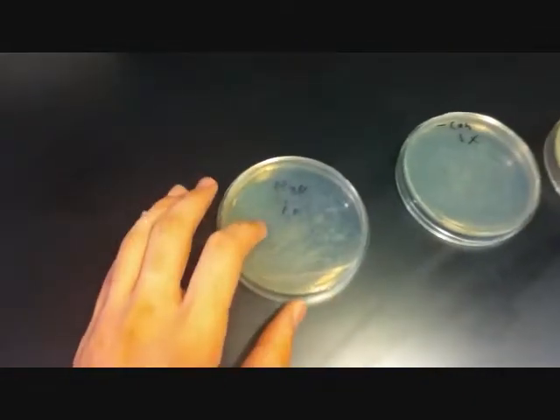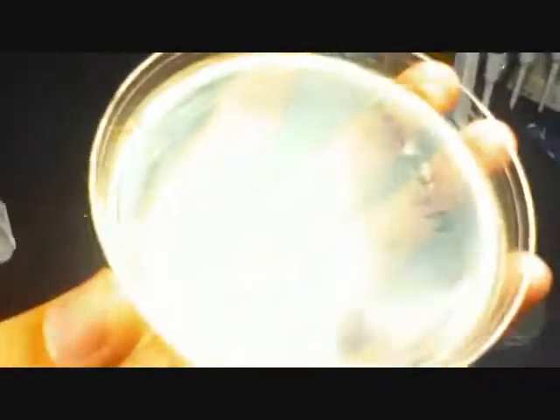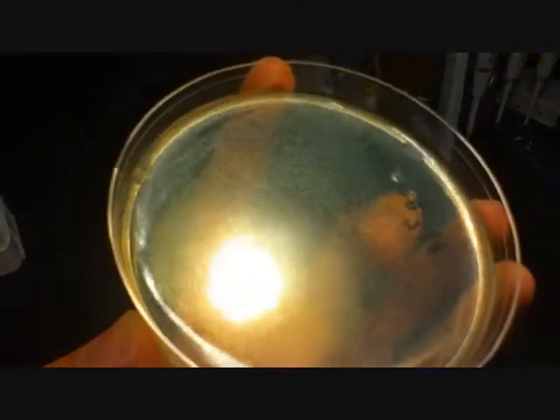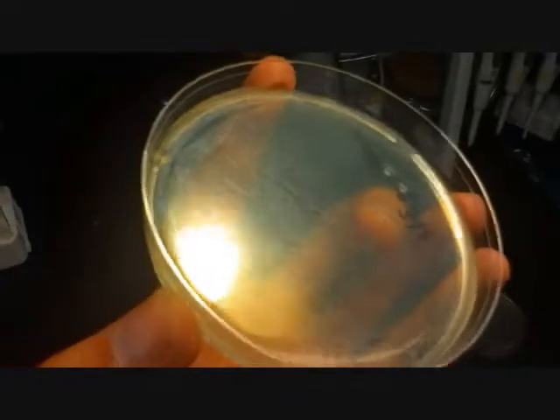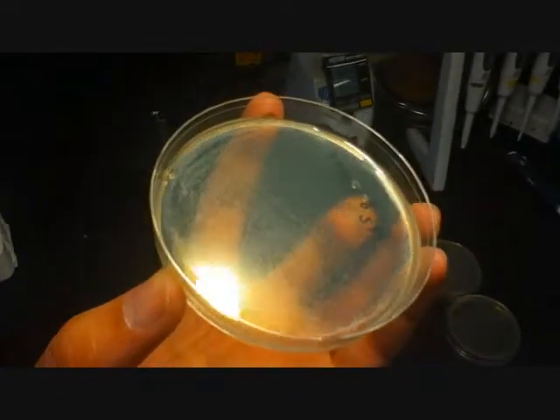This is the H2O concentrated, and I'll just give you a look at what the 1000X dilution looked like. This is H2O 1000X — it was 1000 times less concentrated than the H2O plate, and you can see all that bacteria. So just imagine without any dilution, this thing is dirty.